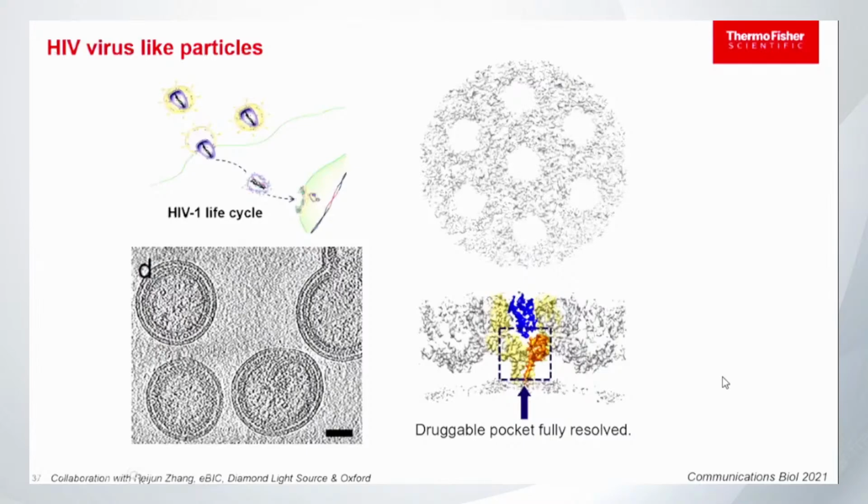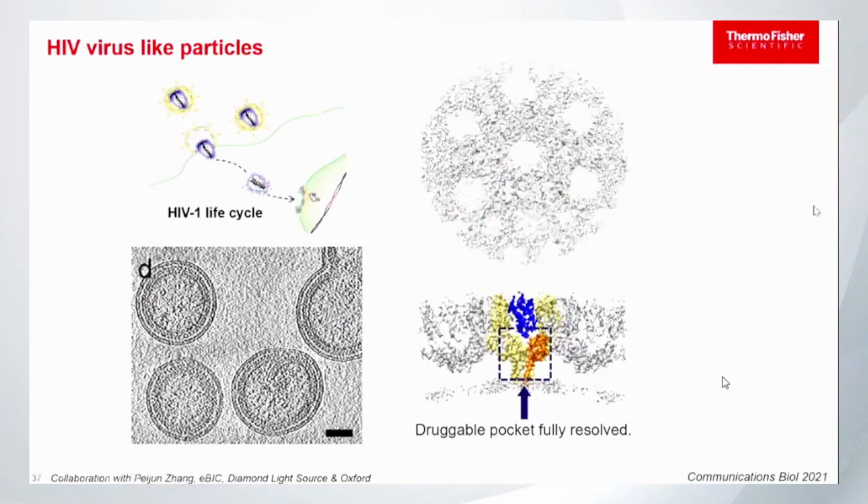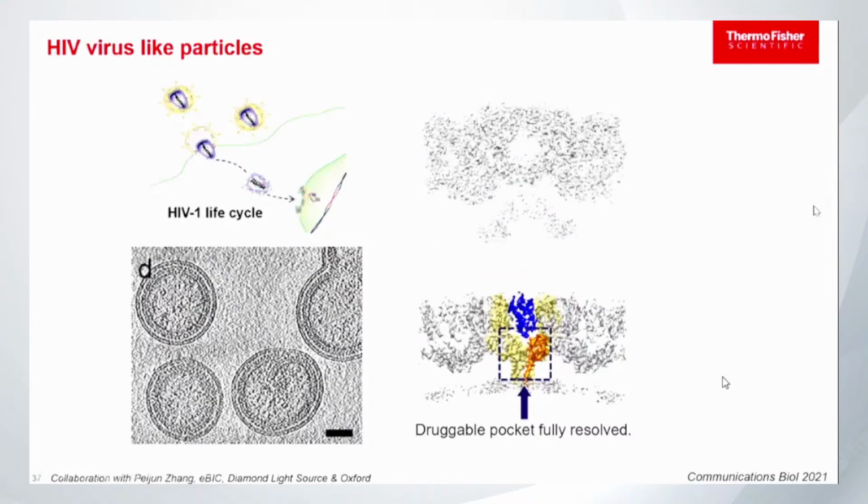You need to do tomography, okay? Some viruses, in particular HIV, have plenty of spikes, and some other viruses almost nothing. Even in the same virus, you can see areas with a high concentration of spikes versus other areas with almost nothing, okay? So it's very random. Using cryotomo, we were able to obtain this beautiful 3D reconstruction of the virus.